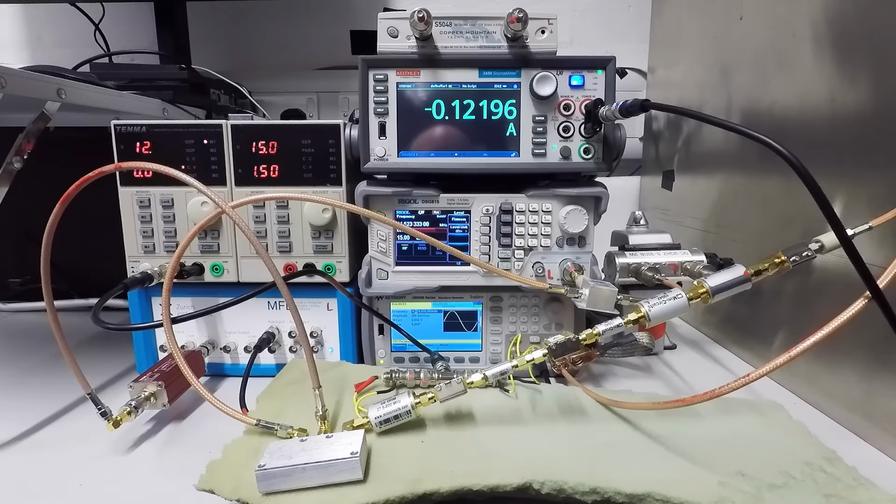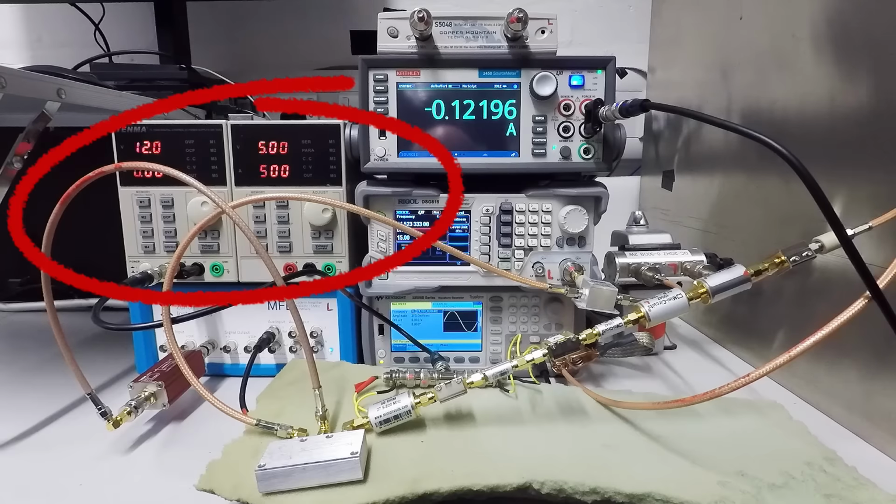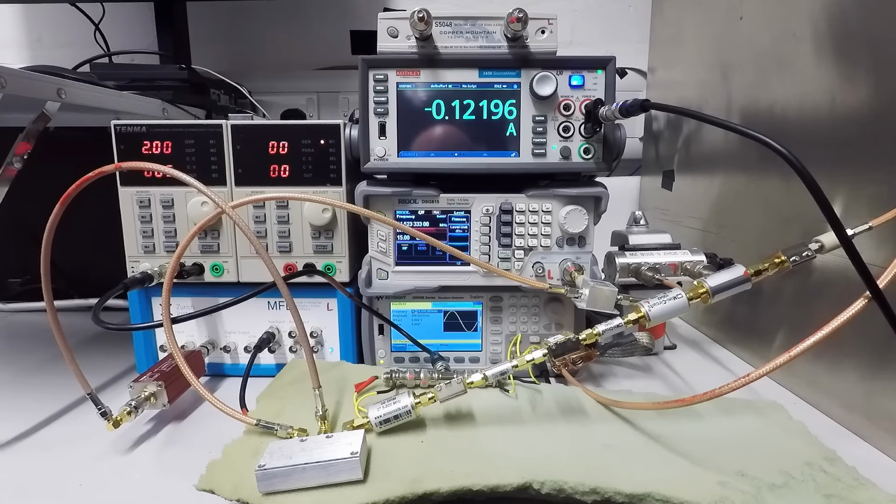Okay, we'll show you a demo of that shortly, but first let's have a look at the equipment in real life. So here is our instrument stack. Do excuse the scrappy piece of foam there. It's actually a high-tech vibration damping mechanism. On the left there we've got a static DC power supply. That is just to power the amplifiers. Underneath that we've got a Zurich Instruments MFLI lock-in amplifier.